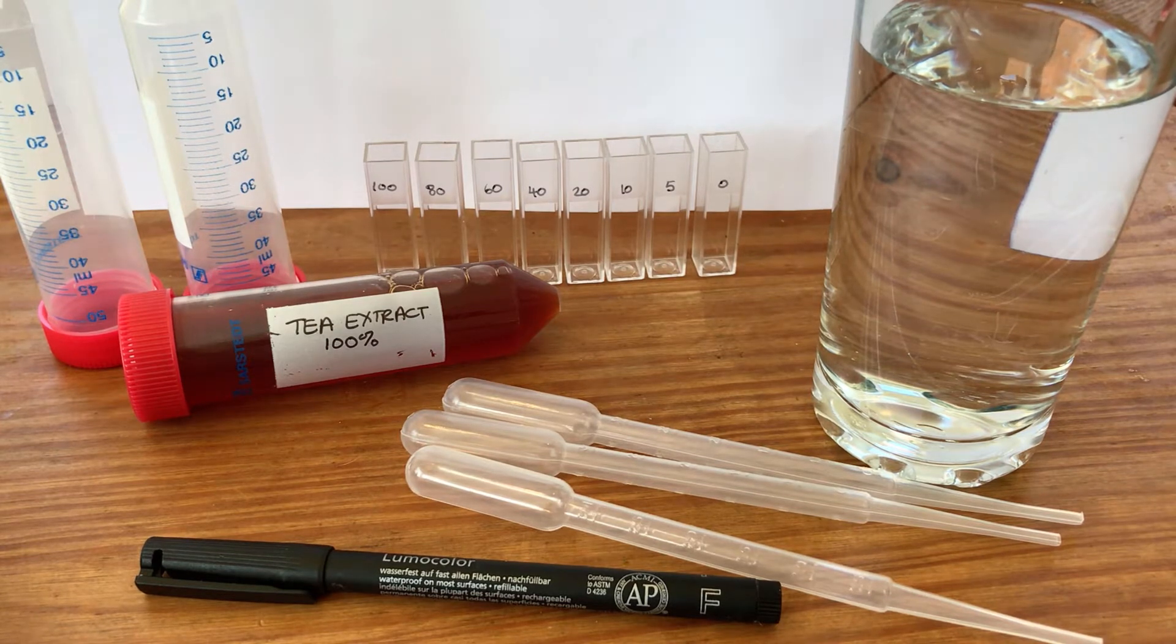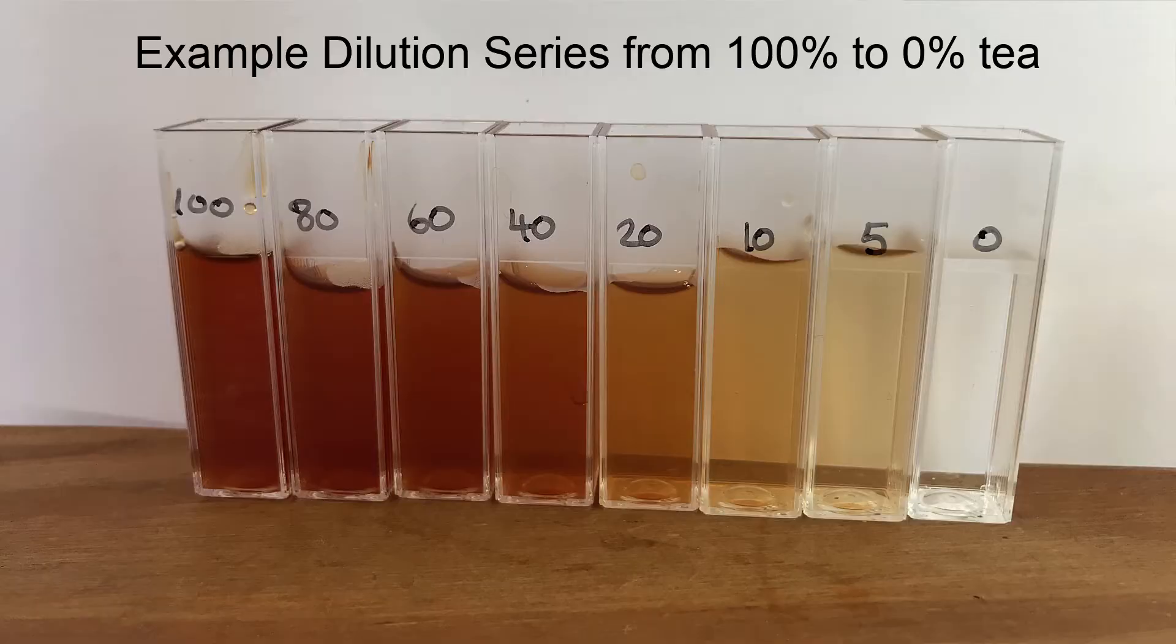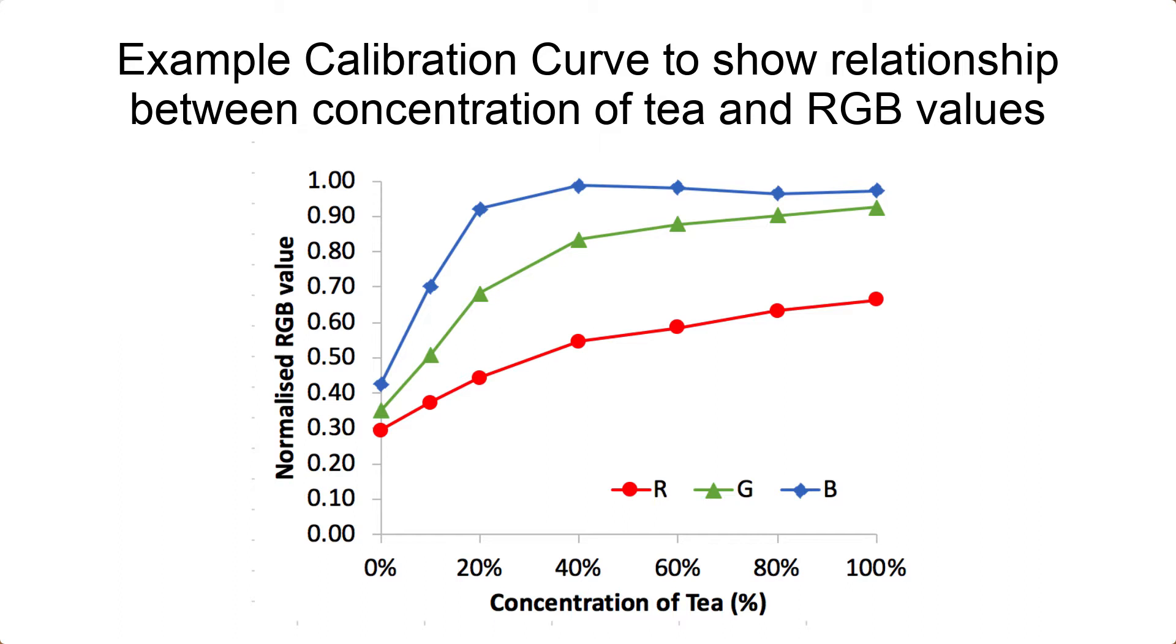What we're going to do is set up a range of different dilutions so that we can test those with our colorimeter. It's really important that we know the colorimeter can detect different concentrations reliably. Before we measure our biological extracts, we set up what's called a dilution series to check that there is a predictable relationship between concentration and our output, which in this case is the RGB values on our phones. That helps us be really sure that we're measuring the thing we think we're measuring.